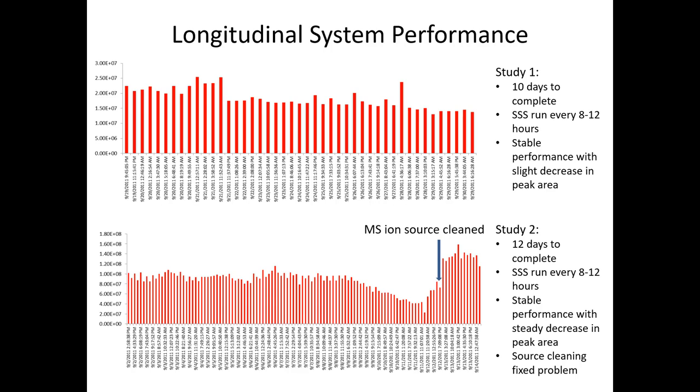So this is what you would expect it to look like over that period of time. This is a second instrument looking at that same kind of peptide, and this is just fine variability. This is kind of what we're accustomed to. But then you see this decrease. So that was not a good thing.